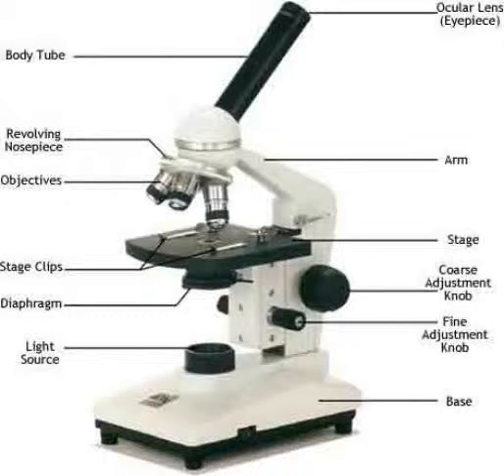To get rid of bubbles, raise and lower the cover slip until any trapped air is released. Do not press directly down on the cover slip. If there is not enough water under the cover slip, add water at the edge. Number 2. Put your slide on the microscope stage and clip it in place. Position the slide and adjust the diaphragm to obtain the appropriate light for viewing.